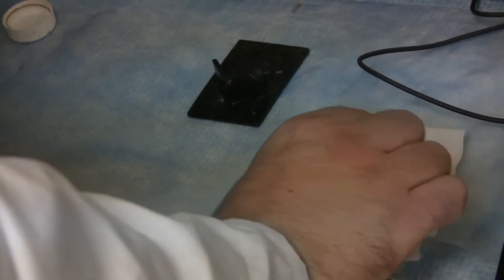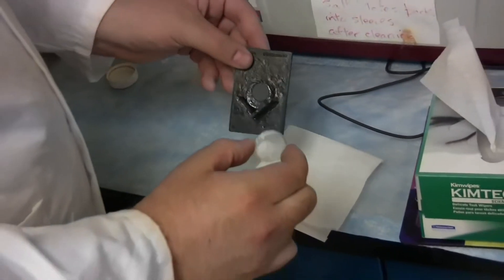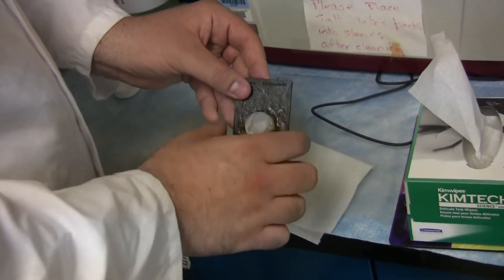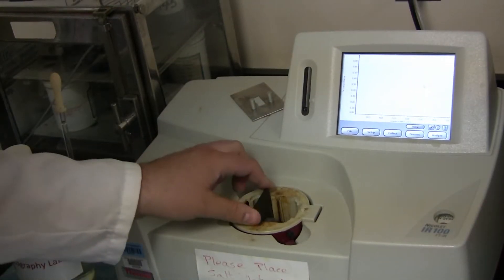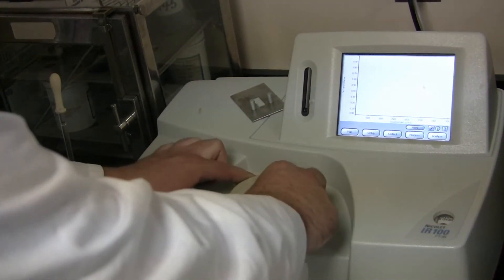Take the other one and sandwich it on top. Place this sandwich into the slide, then place this into the Nicolette machine. Make sure to put the cap on top.